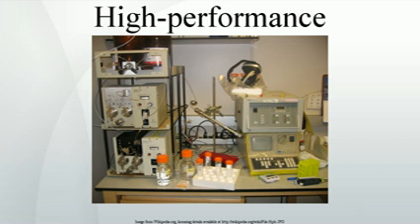The components of the sample mixture are separated from each other due to their different degrees of interaction with the sorbent particles. The pressurized liquid is typically a mixture of solvents, for example water, acetonitrile and/or methanol, and is referred to as a mobile phase. Its composition and temperature play a major role in the separation process by influencing the interactions taking place between sample components and sorbent. These interactions are physical in nature, such as hydrophobic, dispersive, dipole-dipole and ionic, most often a combination thereof.